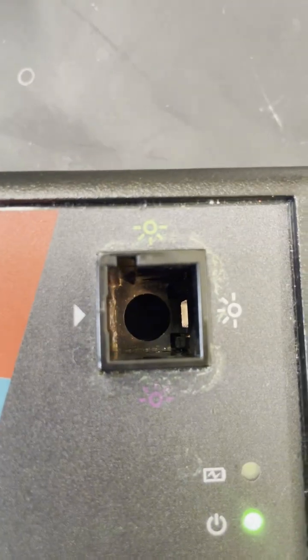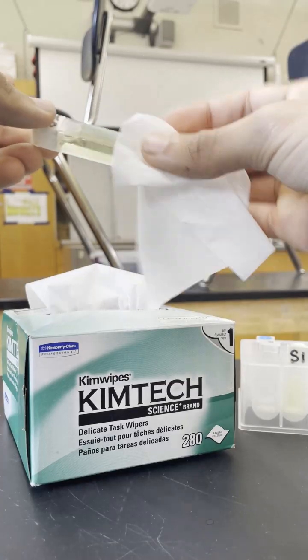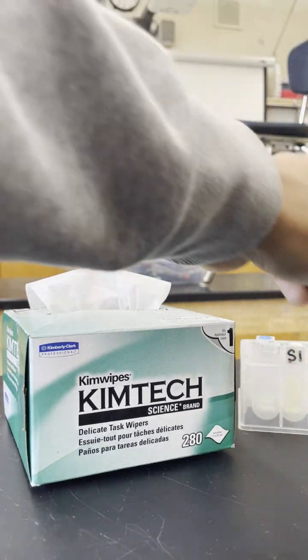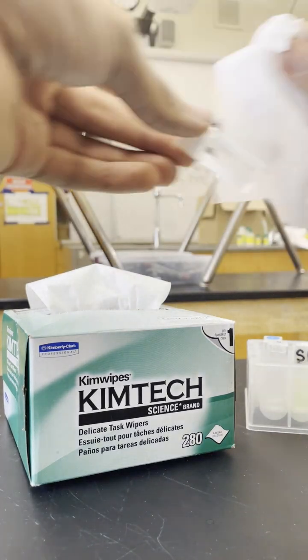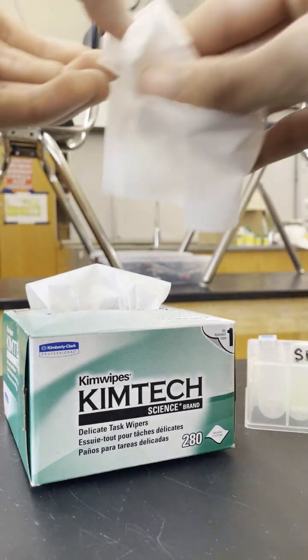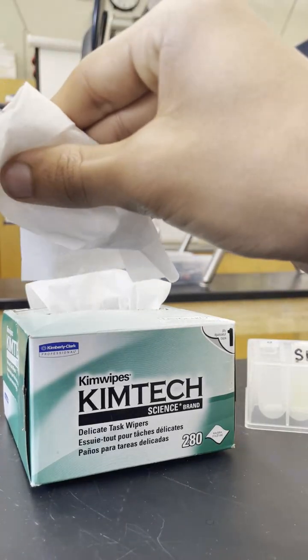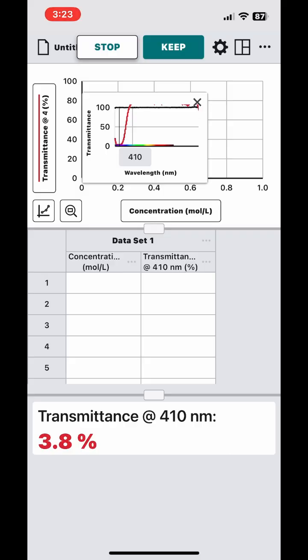This is where you actually put the cuvette in the spec, and you just want that little white arrow to be going through the sides without any ridges on it. Also, these are Kimwipes. They're just used to make sure the cuvettes are clean, and so that you get an accurate reading. And they're just extra good at getting all the oil and dust off. And it's also why if you're holding the cuvettes, you want to hold them from the top, not the bottom, because the oils from your hands are going to get in the way and get you an inaccurate reading.